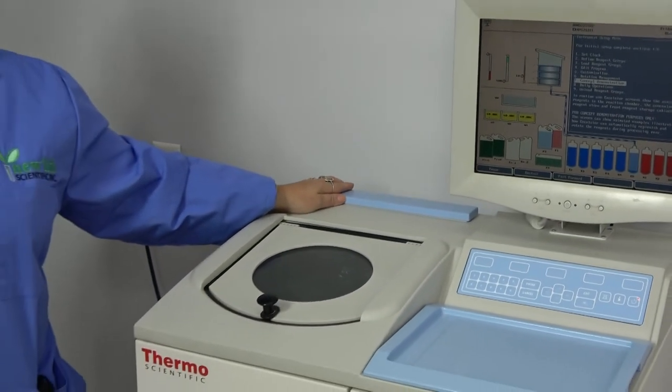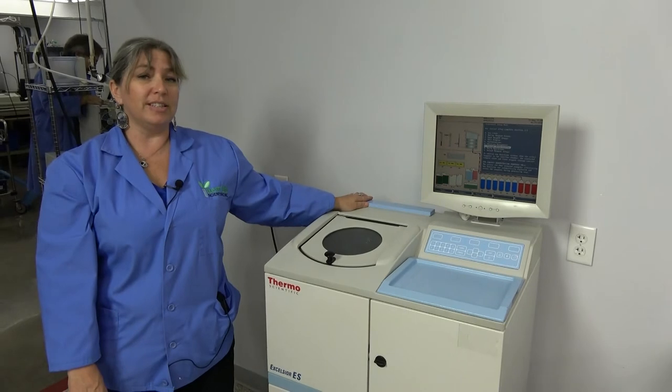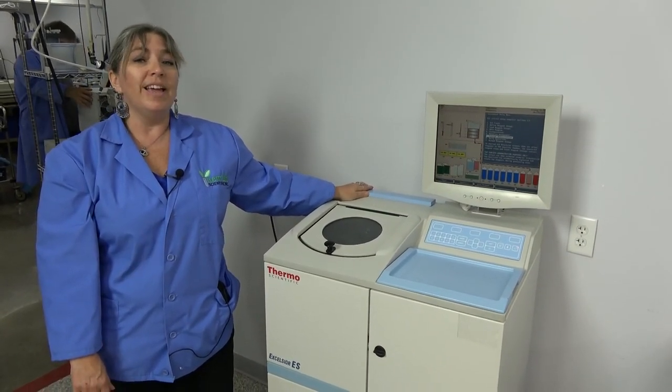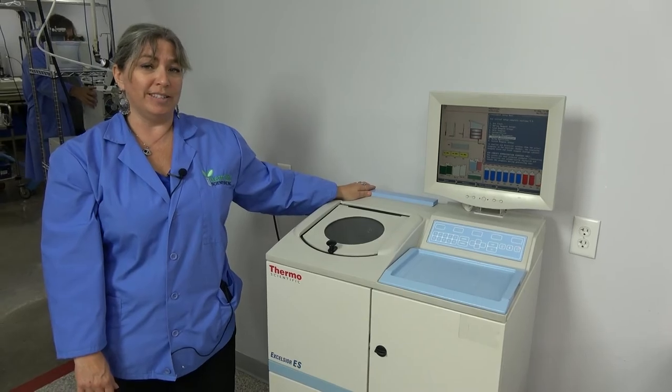This item has been thoroughly checked out by our in-house technicians. It is backed by our 90-day warranty and we have it on hand currently in our Cartersville, Ohio facility.